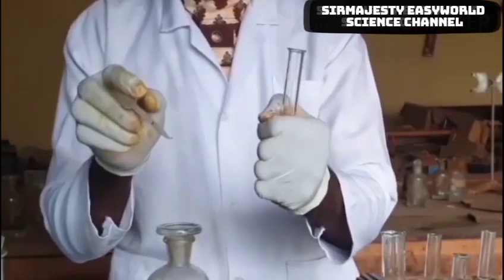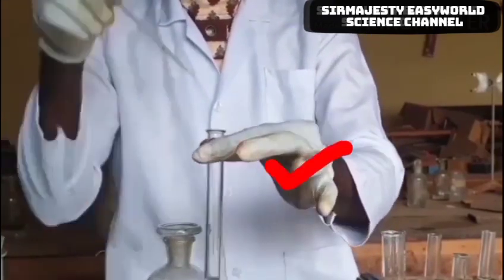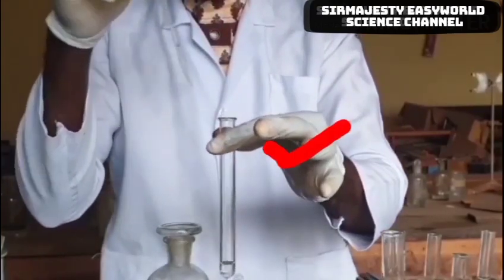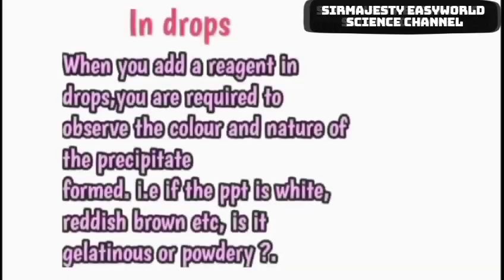Some of the basic guides during salt analysis: you don't hold test tubes this way. You hold it at the upper part near the mouth, so that you can observe the reaction taking place below. Holding it this way will cover your eye from observing what is happening inside the test tube. So it is advisable you hold it this way.